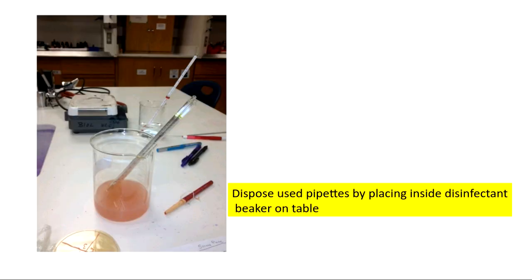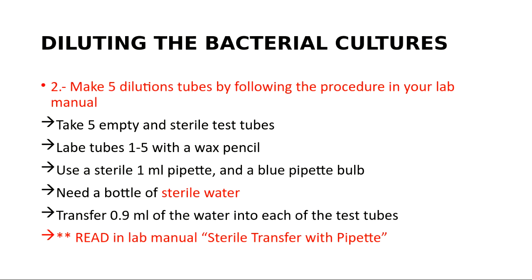So the first thing we need to do is dilute a sample, and this exercise is showing what we actually do in the lab. We need to tell students what we're going to do with the supplies. We're going to be working with bacteria, so we need to know where to dispose of things. We'll be working with pipettes, which are used to pick up microorganisms, so they have to be put in a disinfectant afterwards.